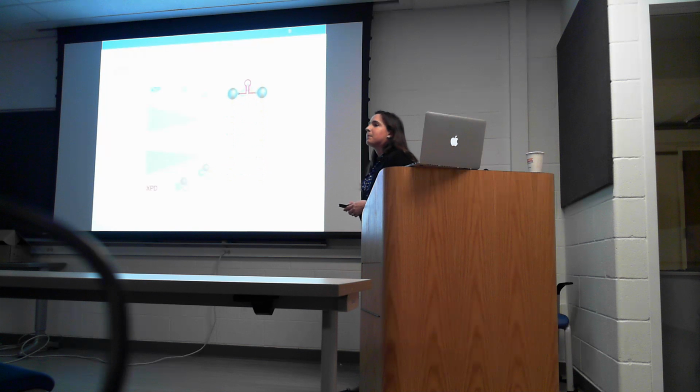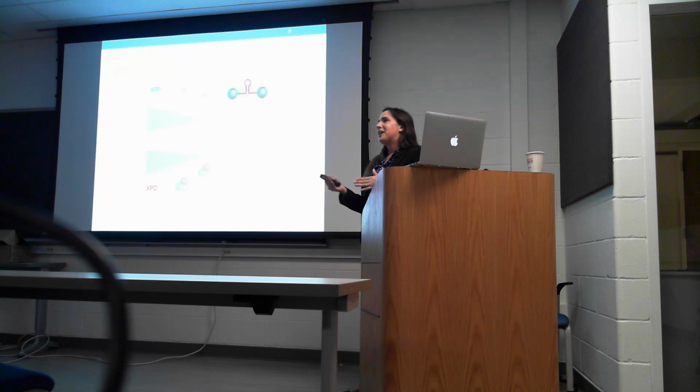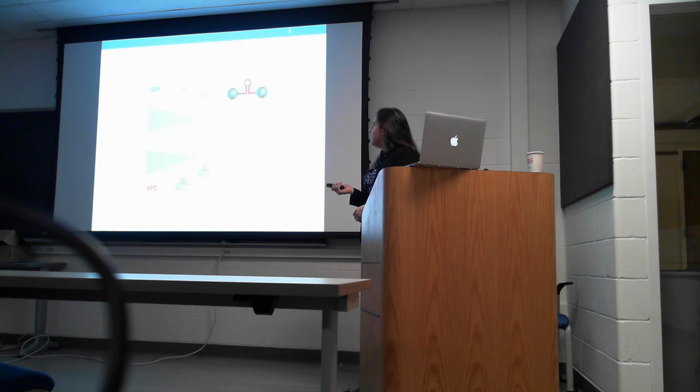So how do you know when the binding occurs? You don't. You just wait a while, hope for the best, move, and if you see unwinding, then something was there, and if you don't, then you're unlucky. It's about 30% of the time I see binding and unwinding. Since our loading site is only big enough for a single XPD, we know there's only one there, and it doesn't start unwinding until we move into ATP.